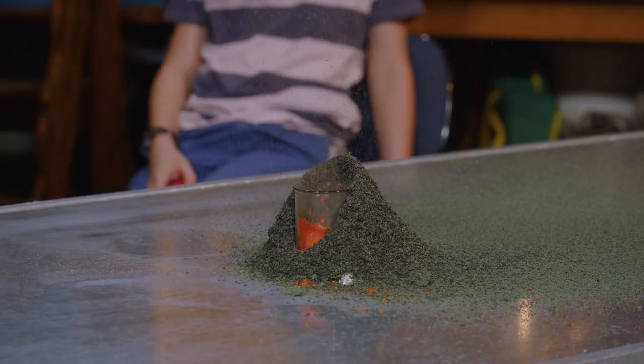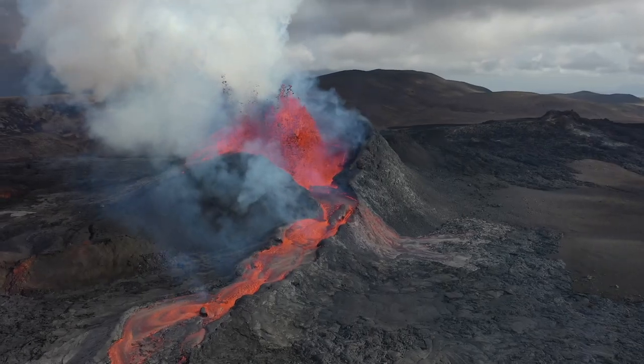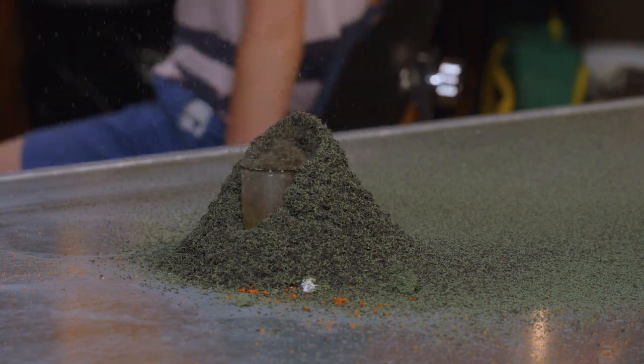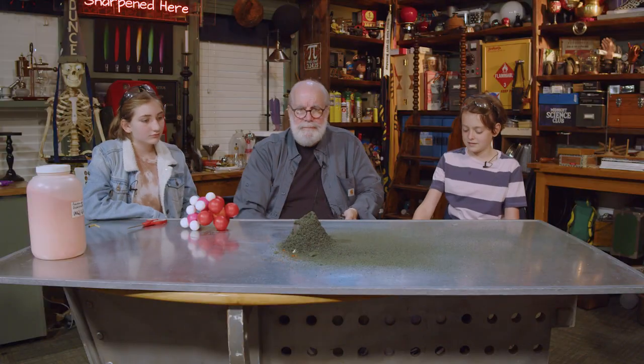That is often used to demonstrate what's called a cinder cone volcano. They call that the volcano demonstration. What you are observing is something called a phenomenon. Wonder what it tastes like?